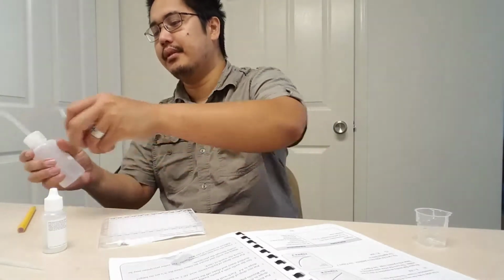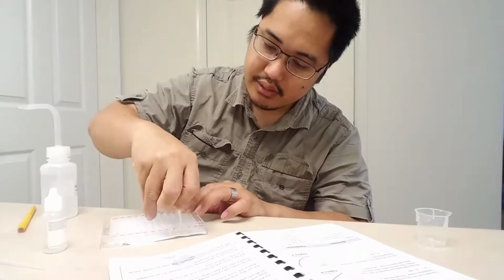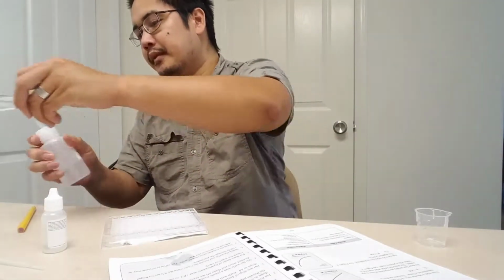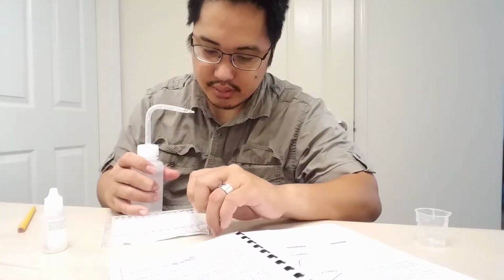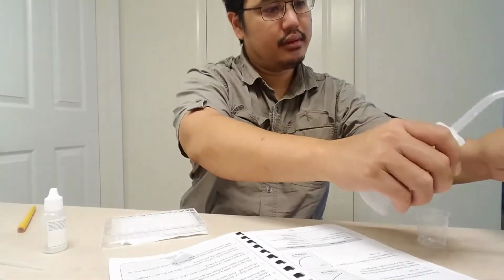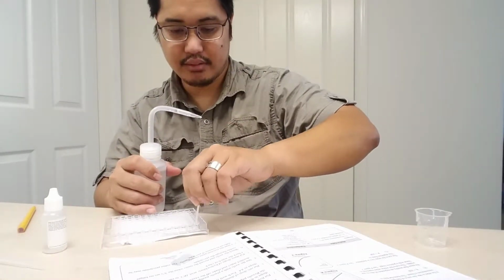And then I'm going to stir this one. Spray, shake, stir. Spray, shake, stir. Spray, shake, and stir.